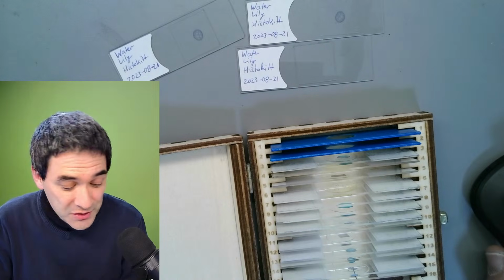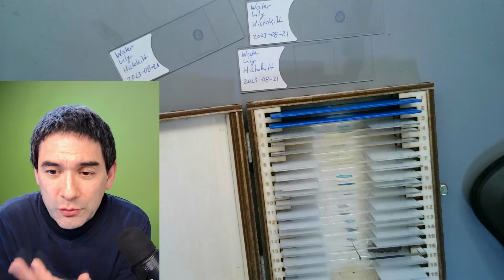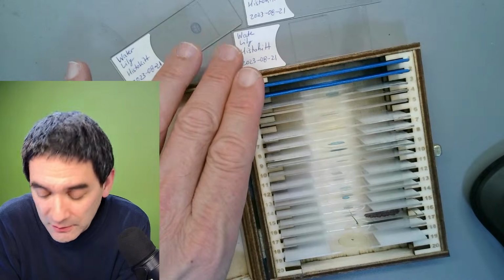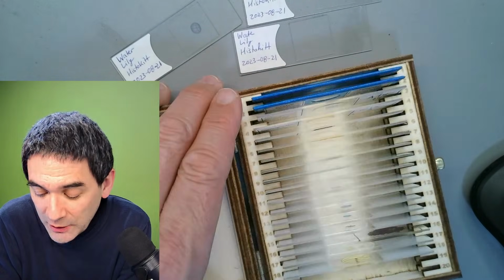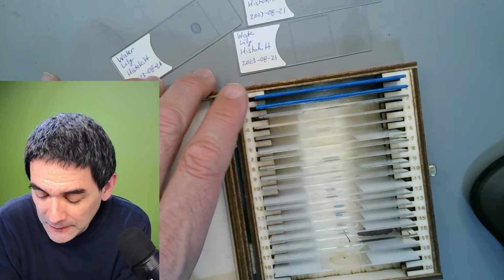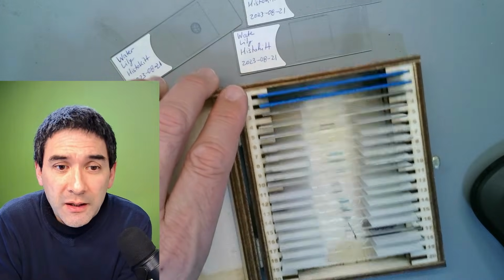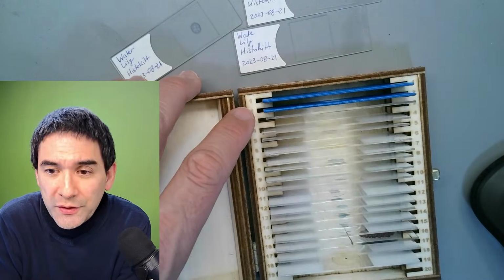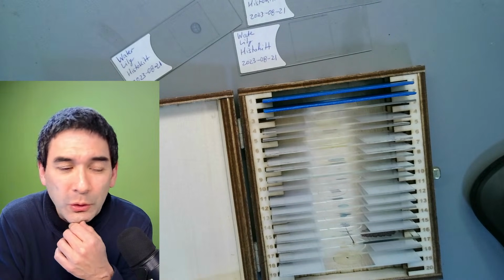We're going to see how this actually works out this time. Because it's a little bit experimental, I decided to do something a little bit traditional again, because maybe there are going to be a few new viewers. I've put out a whole bunch of microscope slides, which I consider to be some of my more favorite ones. Not all of them are made by myself. Some of them are commercial slides, but they look kind of nice. Every now and then I return to those, and I simply would like to share them with you. Of course, this also gives us an opportunity to chat about other things that you might want to talk about.